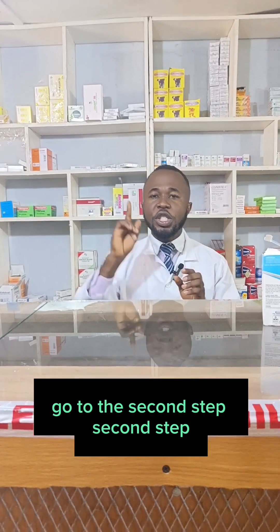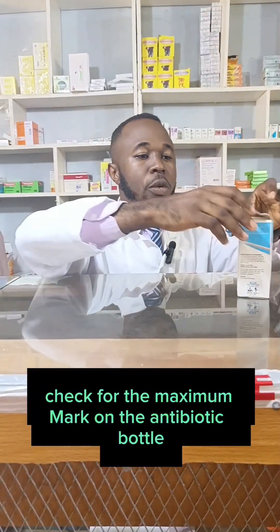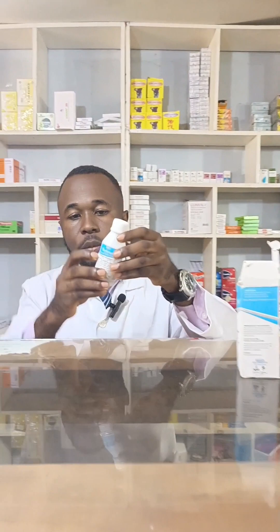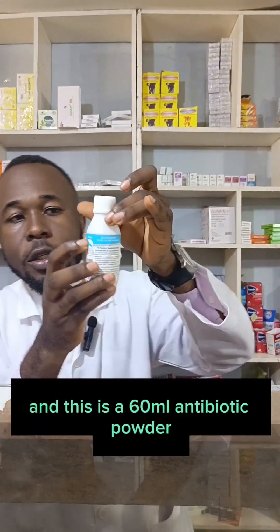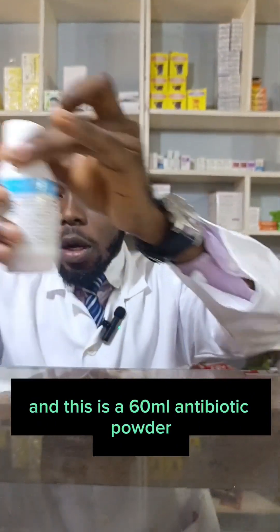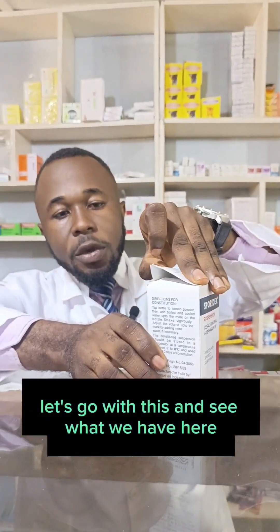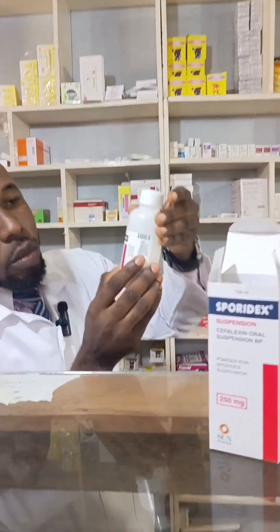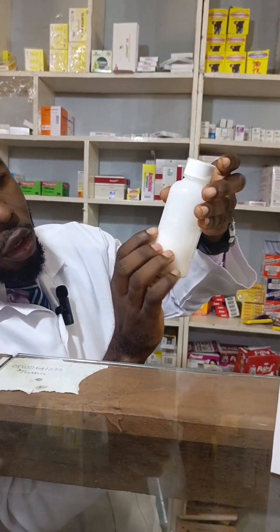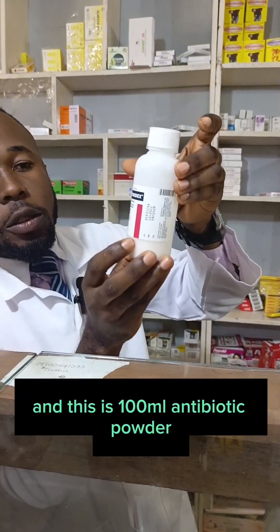Second step: check for the maximum mark on the antibiotic suspension. This is the maximum mark, and this is a 60 ml antibiotic powder. Let's go with this and see what we have here. This is the maximum mark and this is a 100 ml antibiotic powder.